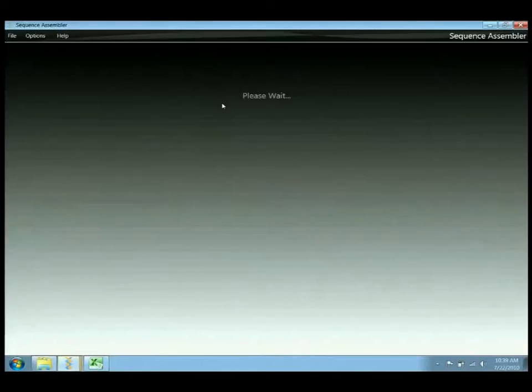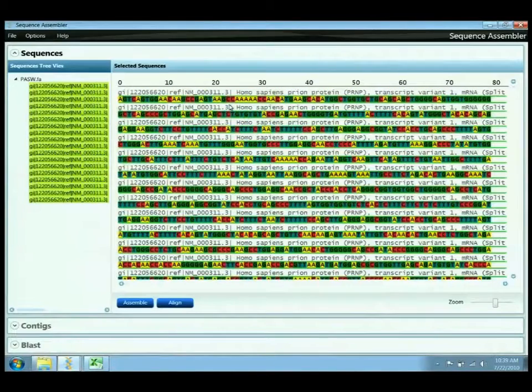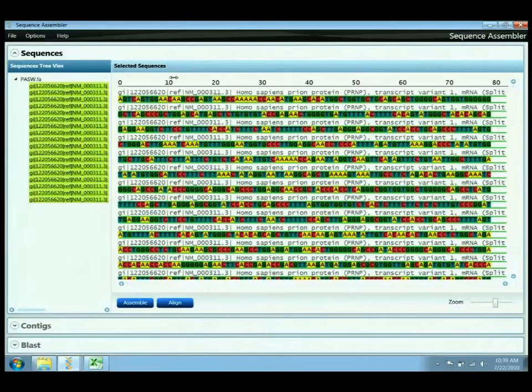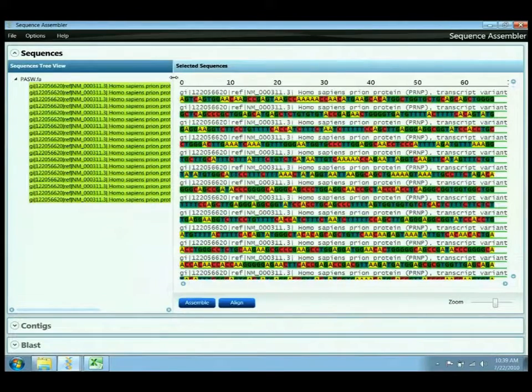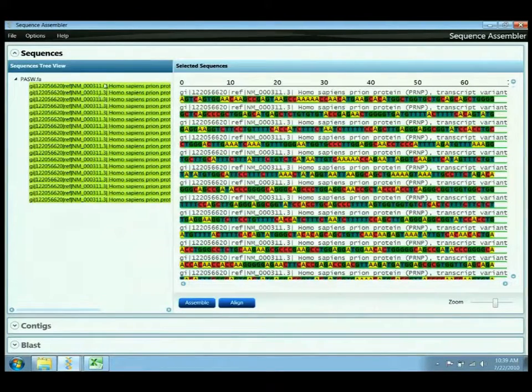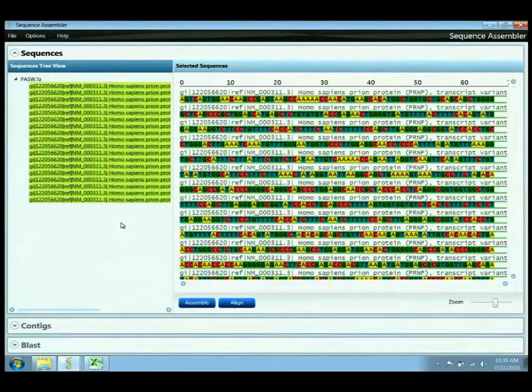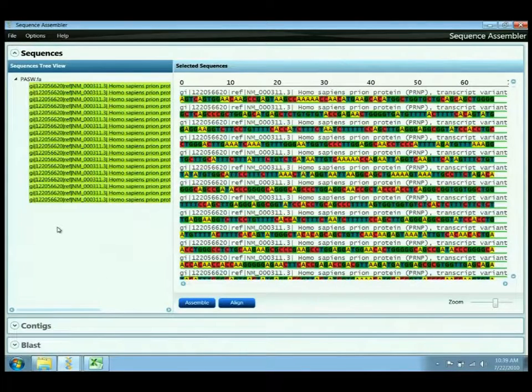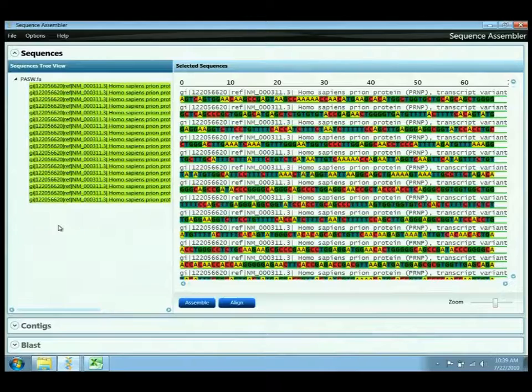I'm currently opening a FASTA file of different DNA sequences for Homo sapiens, essentially human DNA sequences, and the intent of this demonstration is to show the different behaviors and benefits and pros and cons of the different assembly and alignment algorithms provided in the library.